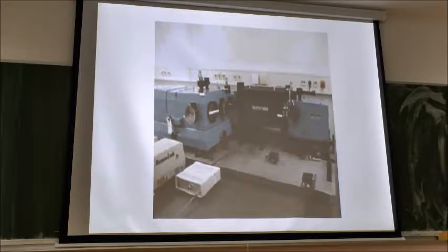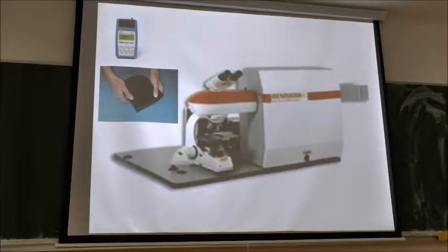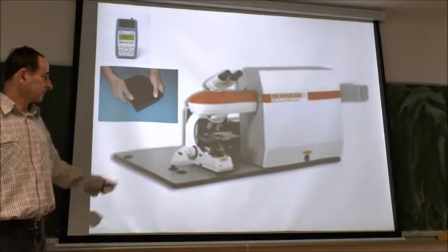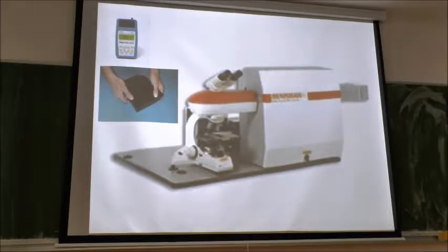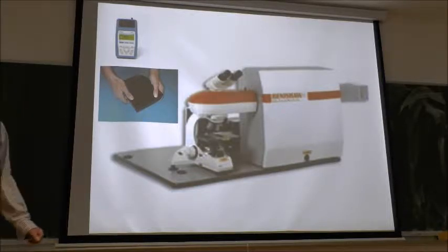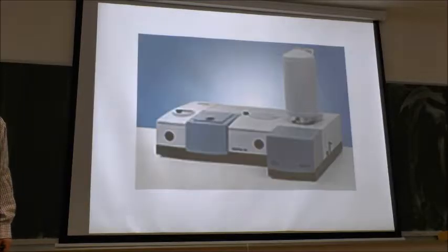Raman effect study itself. Here we have the desktop or benchtop design. This is sold best for years, and also handheld devices, which really are small and quite efficient. They are used by the Army, by geologists. They are small, but the price is not so small, so it's comparable to the benchtop.